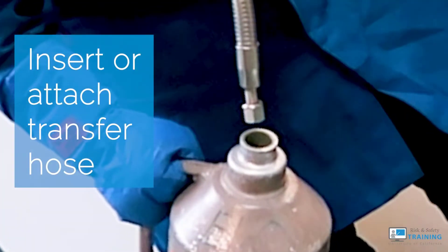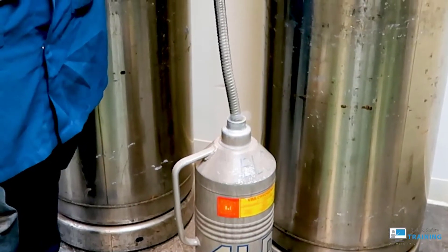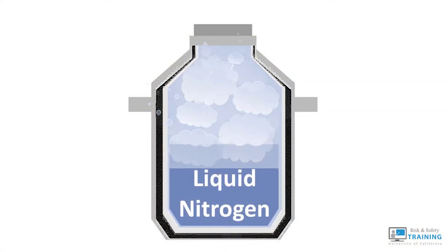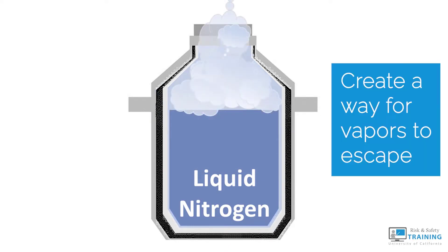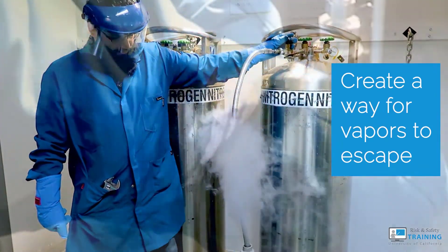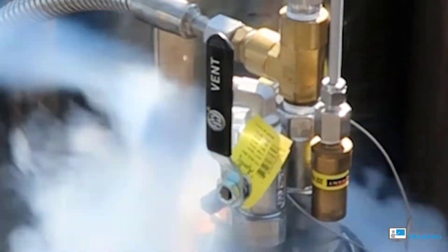Begin by inserting your transfer line into your container. Vapor builds up within all containers you fill, but the problem is that the same space inside gets filled with liquid, so make sure you create a way for the vapors to escape. In an open-mouthed container, vapors can escape around the mouth. In a closed-mouthed container, you'll need to turn the pressure relief vent to release the pressure.